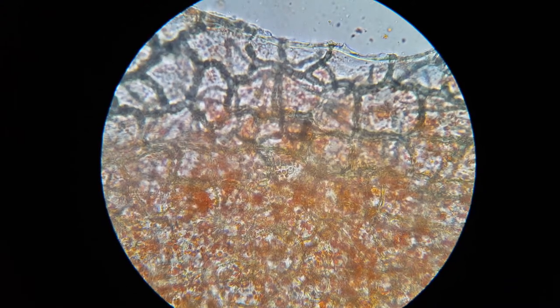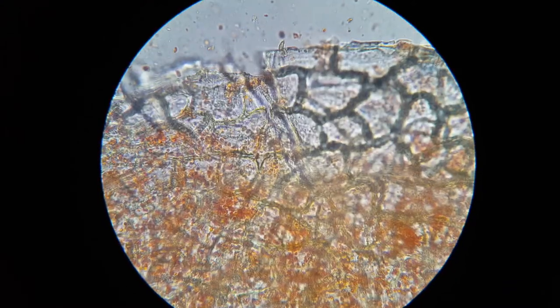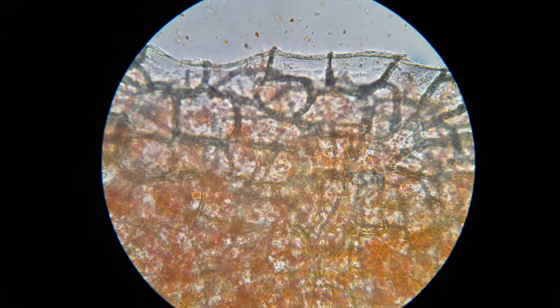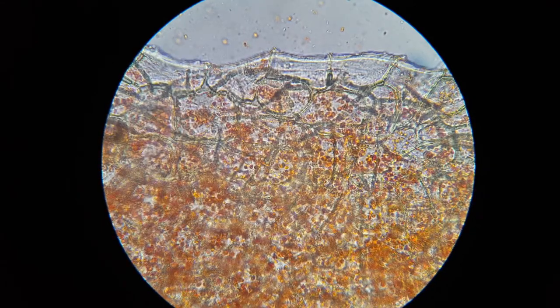You can see little red dots in there — those are little organelles that contain the red pigment. I'm assuming that these organelles are descendants of chloroplasts.